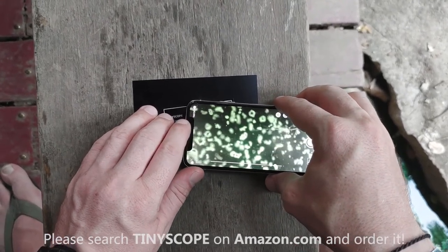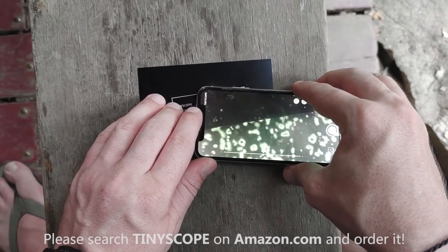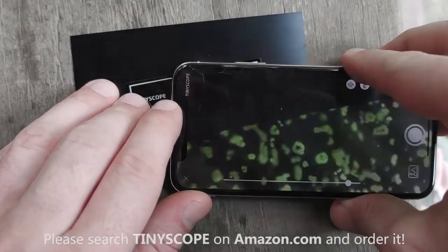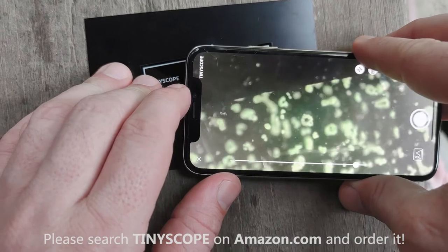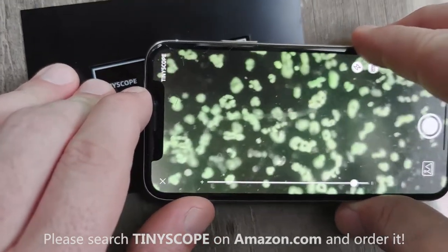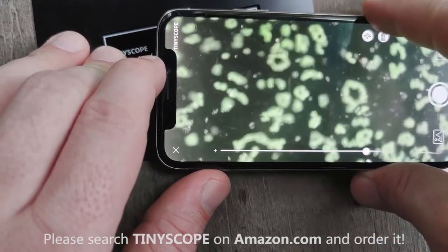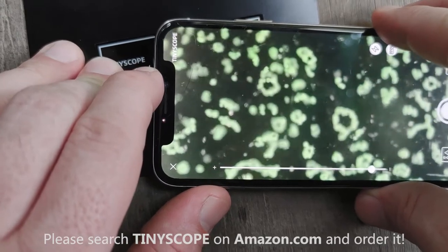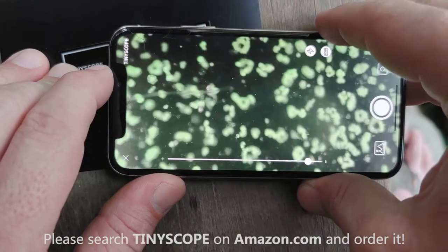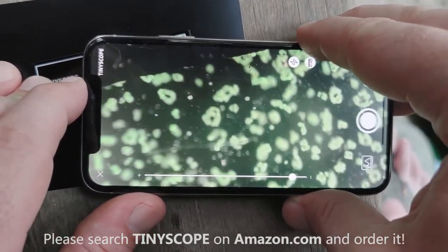Using the black side — yeah, we're getting a pretty good shot there. Oh, there's a bug! Where'd you go, bug? Wow, check that out! There he goes — come back here! This is pretty cool. You can use this to check out water samples from ponds, lakes, and rivers near your home, and even use it to make sure your tap water doesn't have any bugs in it. All right, I hope you enjoyed that!